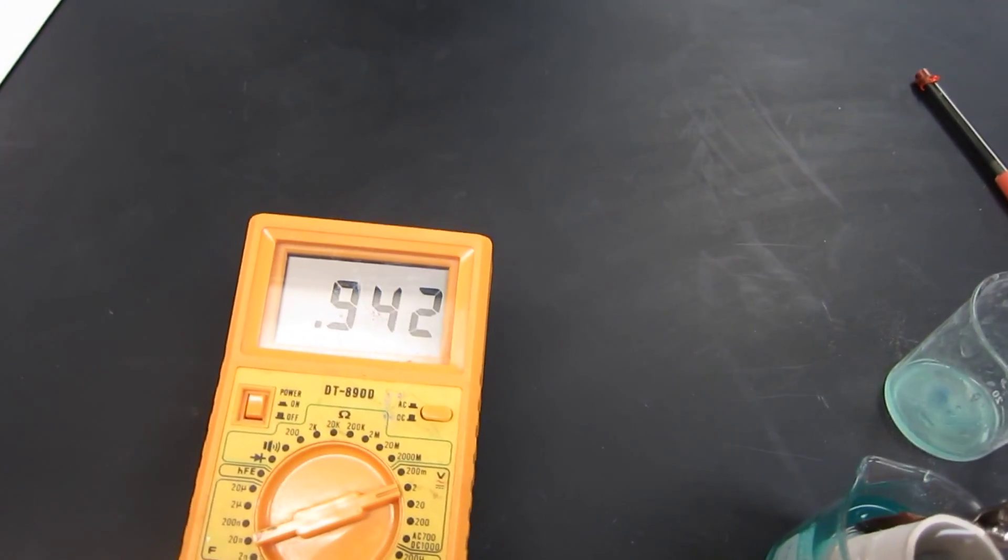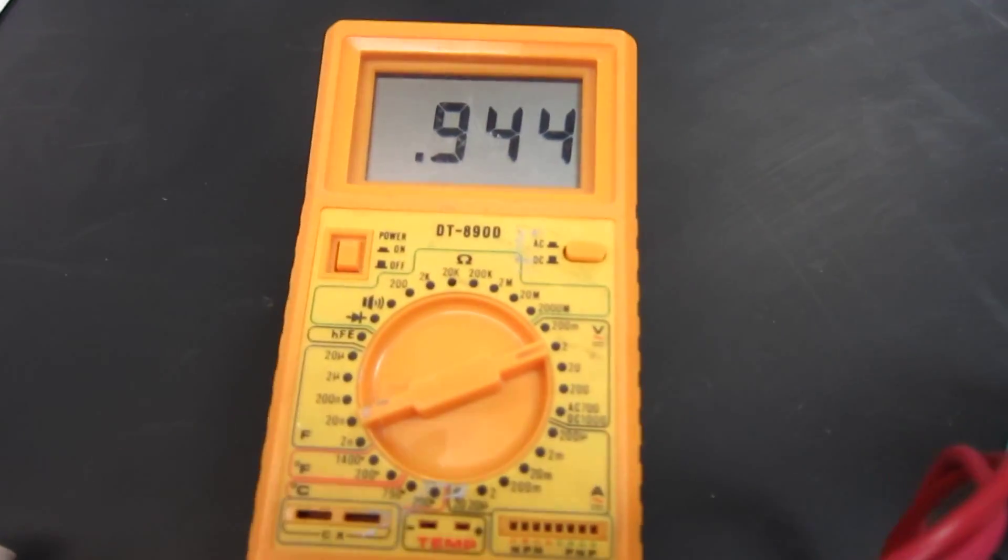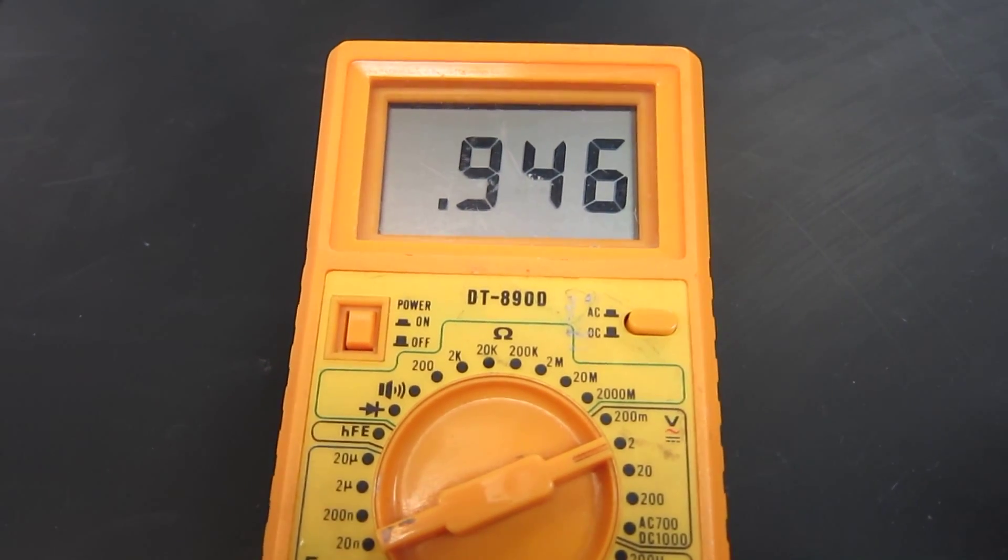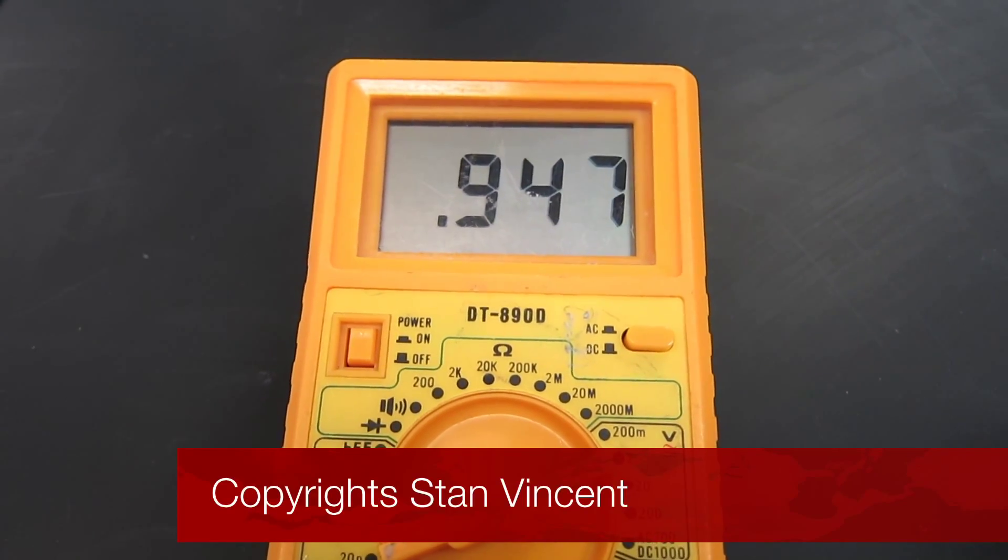Use this data to make your analysis. You may also draw a graph of EMF versus concentration. This should give you the required data to make an appropriate conclusion.